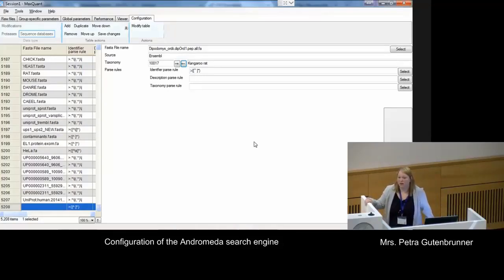Sorry, yeah. Because the ab initio FASTA file would have additional information like 6-frame translation for gene prediction, protein prediction, and for the most standard experiments you would not need this additional information. But of course, you can edit it, but yes, you won't need it.